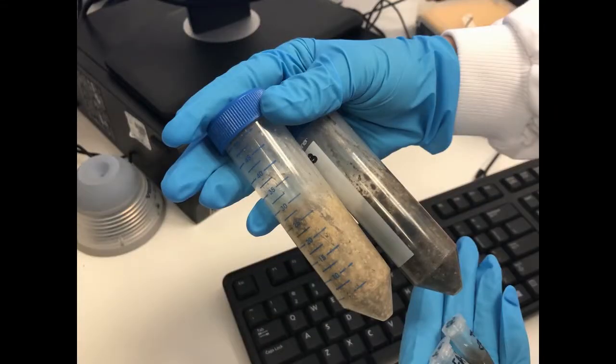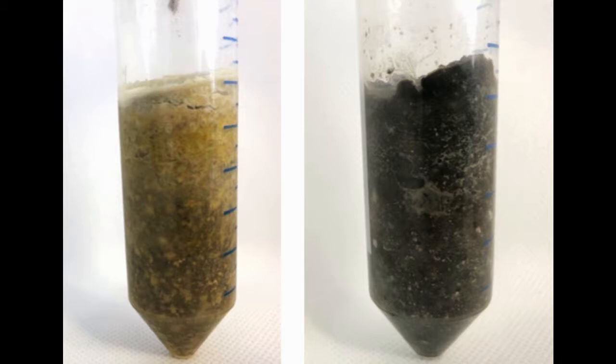Looking at the two samples that I had from the fatberg, they looked very different in colour, and they contrasted in composition. In their fat content, one, the brown one, was negligible in fat, but the light coloured one was like 50% fat. One of the main components of the fatberg seemed to be fibres. There were quite a lot of fibres in there. Some of them looked quite like cellulose, so paper-like.